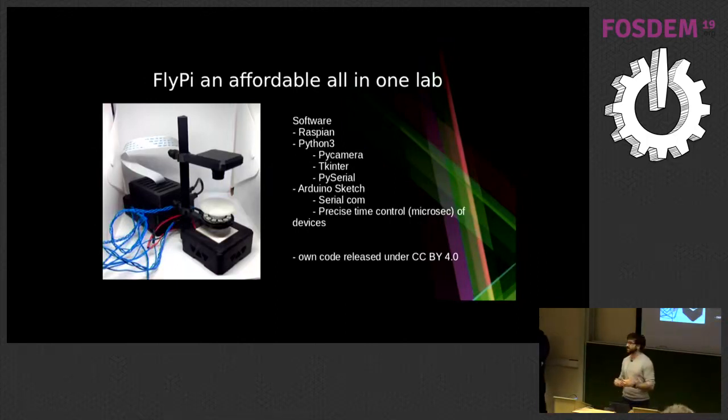Can you compare your microscope with the commercial one? Definitely. So the question was, how can I compare this device with the commercial one? Of course, we're not doing everything that a commercial one can do. For instance, the resolution is one of those things. How far away are you from it? That's the question. We didn't find a solution yet. I could say we're very close in terms of how many micrometers we need to break. Like, if there are 100 people who want to use it, it covers 99 of the cases.